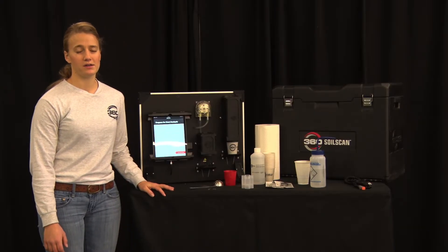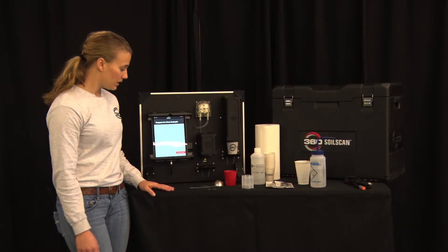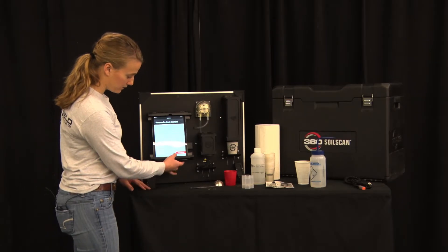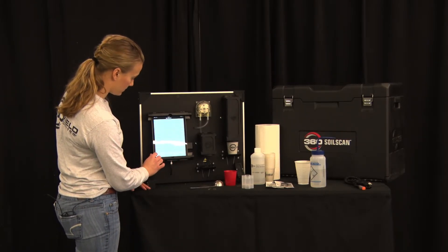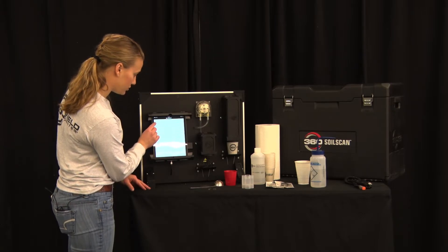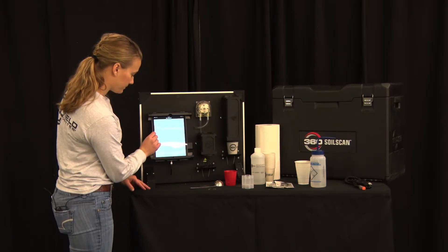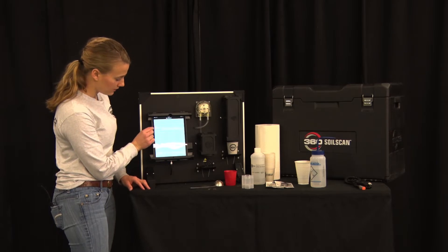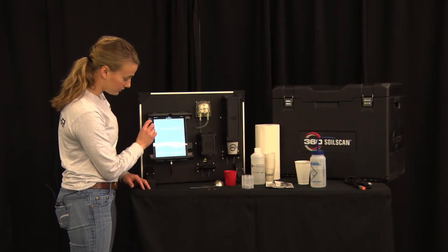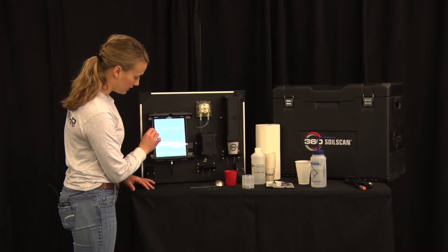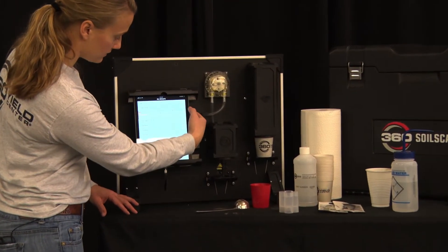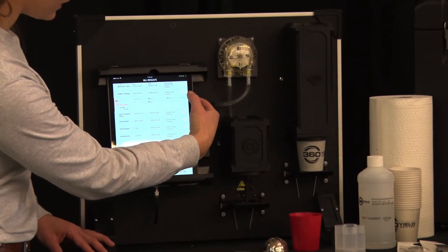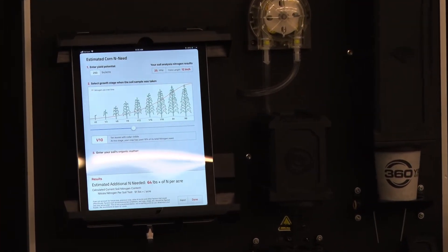If you did not calculate n needed at the time of taking the sample you can find that sample by going to all results and finding the farmer that you had saved it under. So here I had dealer training and sample number one. Every sample you take under the farmer for me it was dealer training would be under this tab here and then you can simply select calculate n needed and you'll be taken to the same page.